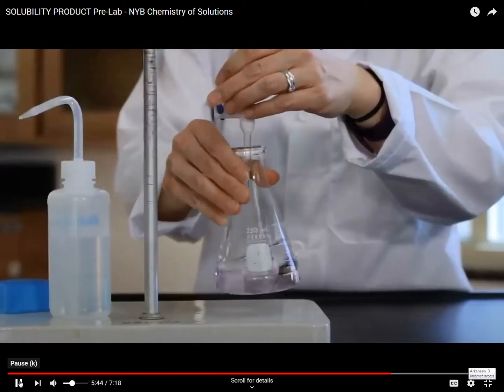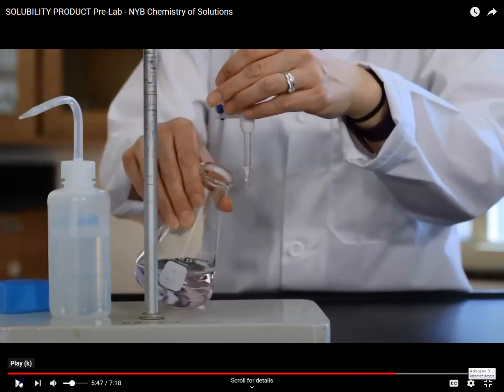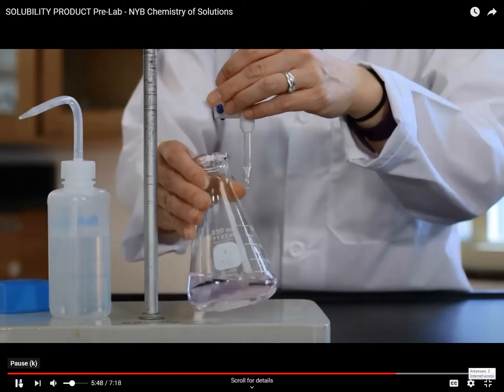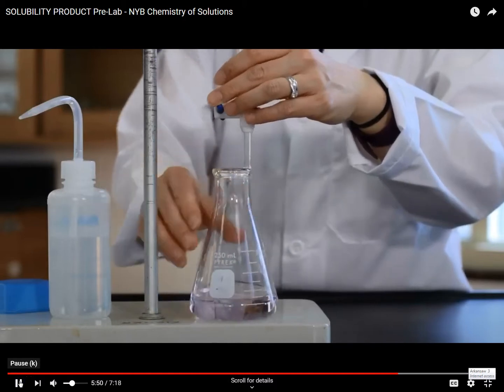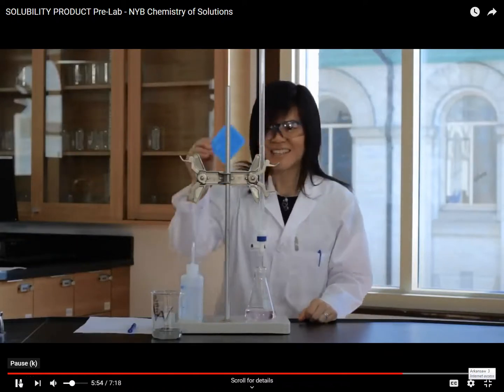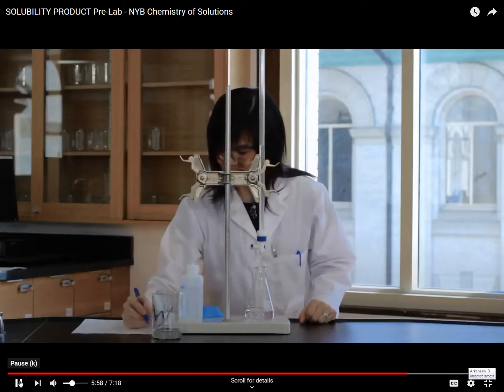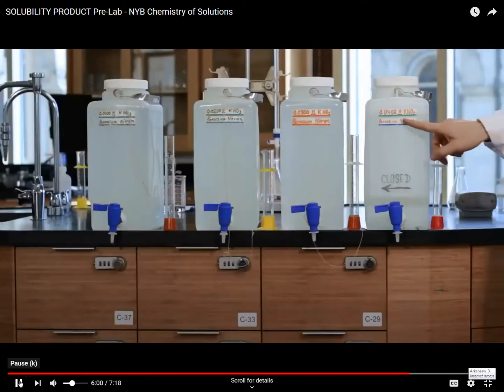The solution will be a faint pink when the endpoint is reached. Now, at the end point, we know that our hydroxide ion concentrations have knocked out, if you will, all of our hydrogens. Record the volume of sodium hydroxide used in the titration. This will be our final volume reading, so we know how much.